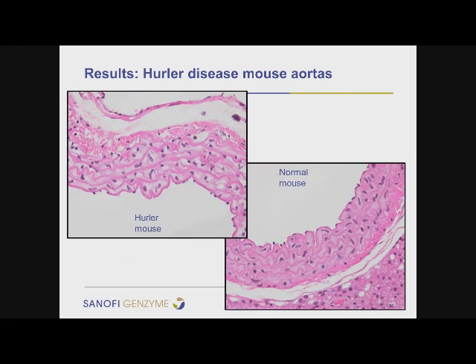So the aorta really requires a lot of elasticity. With every contraction of the ventricles, a lot of blood is being ejected into this aorta, and it really needs to swell and then shrink again to accommodate the ejection of that blood. And along the wall of the aorta you'll see these bright pink lines, and this is actually elastin, and this contributes to the ability of the aorta to stretch and then retract again.